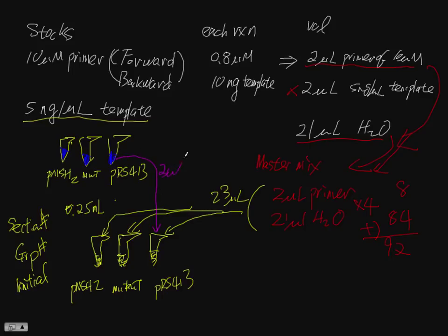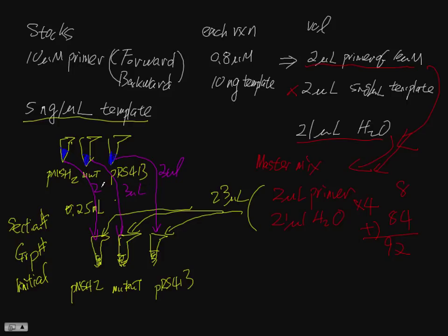Basically add 2 microliters of that. Each one is 2 microliters. Make sure they match them.